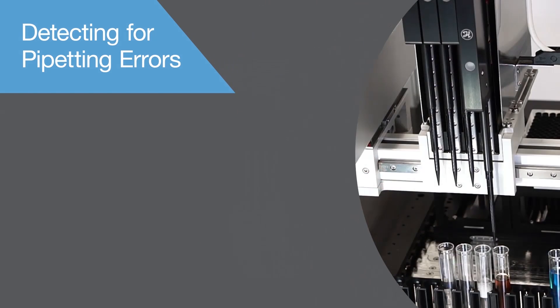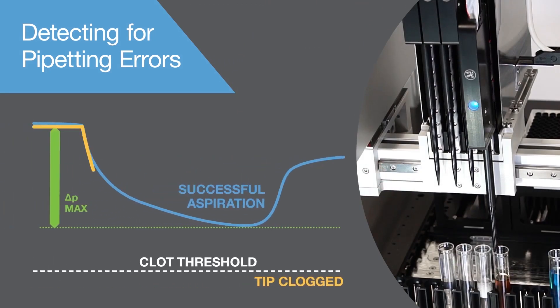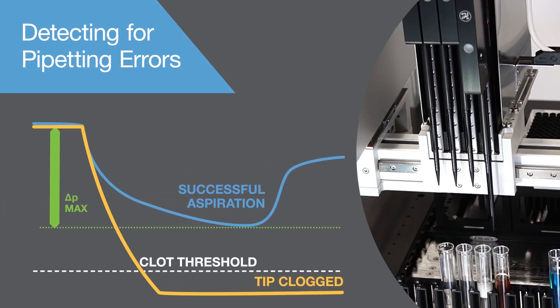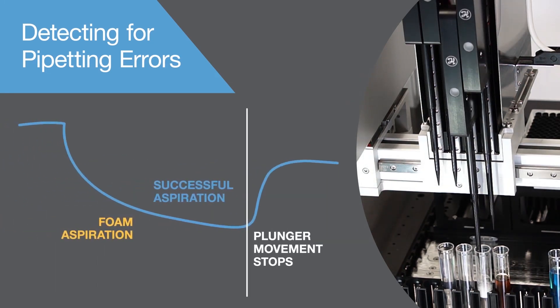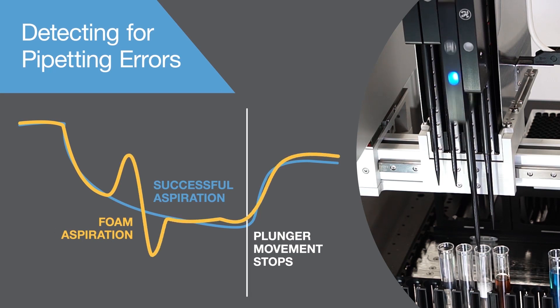Clots are detected during an aspiration step when the vacuum pressure exceeds the predefined threshold. Foam can make it difficult for a pipet channel to detect the surface of the liquid. If the channel begins to aspirate foam, spikes in the pressure curve are detected.